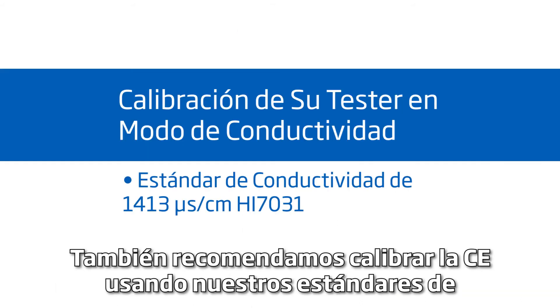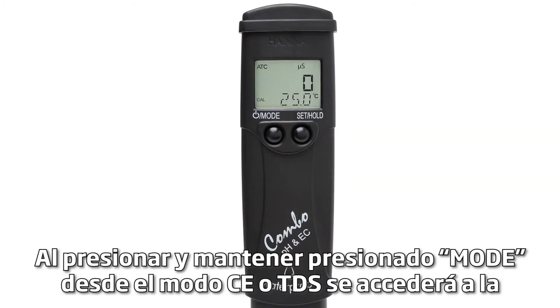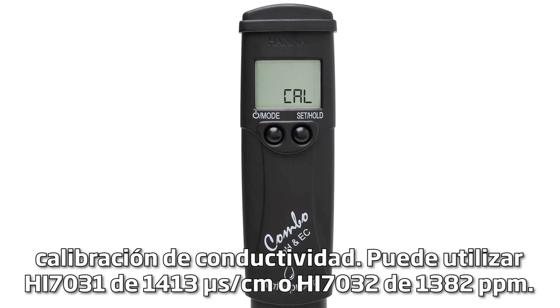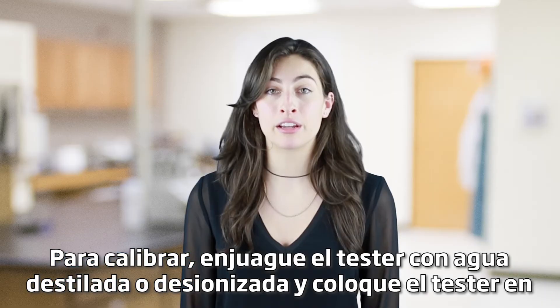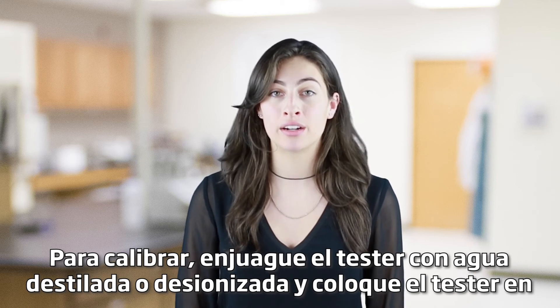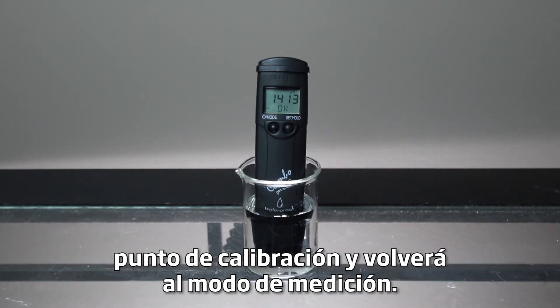We also recommend calibrating EC using our conductivity standards. Pressing and holding MODE from EC or TDS mode will access conductivity calibration. You can use either 1413 µS/cm HI7031 or 1382 ppm HI7032. To calibrate, rinse the tester with distilled or deionized water and place the tester in your desired EC standard. After the reading is stable, the tester will accept the calibration point and return to measurement mode.